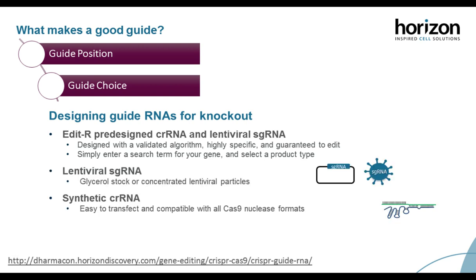Pre-designed guide RNAs are great for a knockout, but for a knock-in, the cleavage site has to be as close as humanly possible to that alteration site. So you will probably need to design your own guide RNA for this. As I said, we have this design algorithm available for you to use, and it is really user-friendly. This is a free design tool that we have put on our website, and it helps you choose the most effective guide RNA for your specific genomic space.